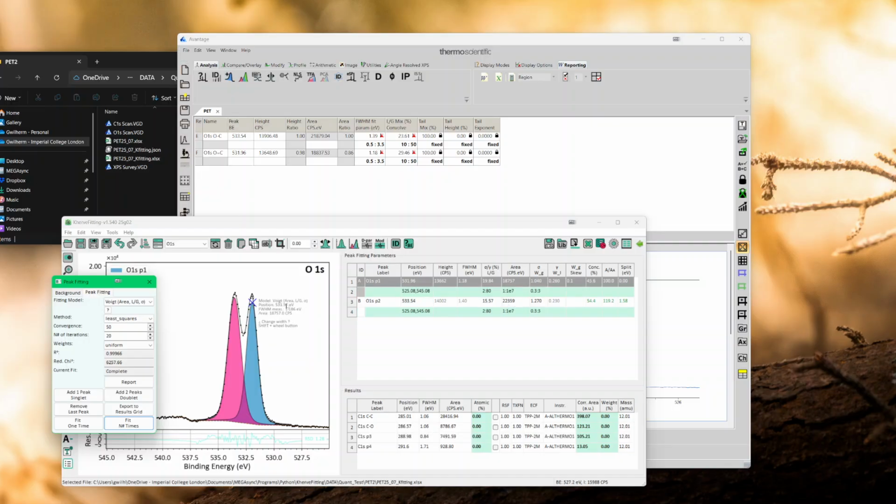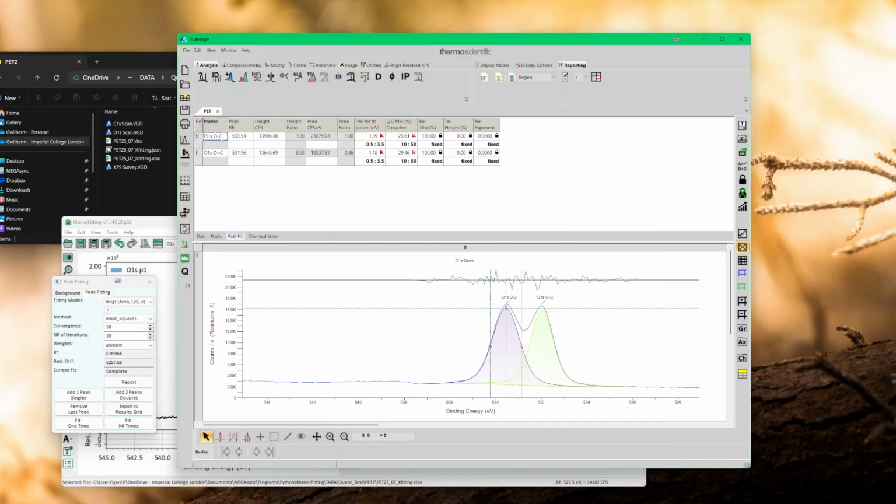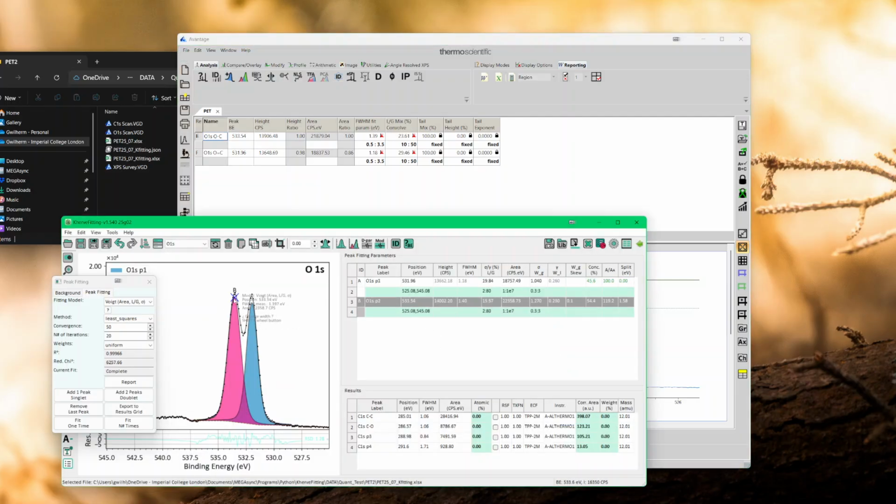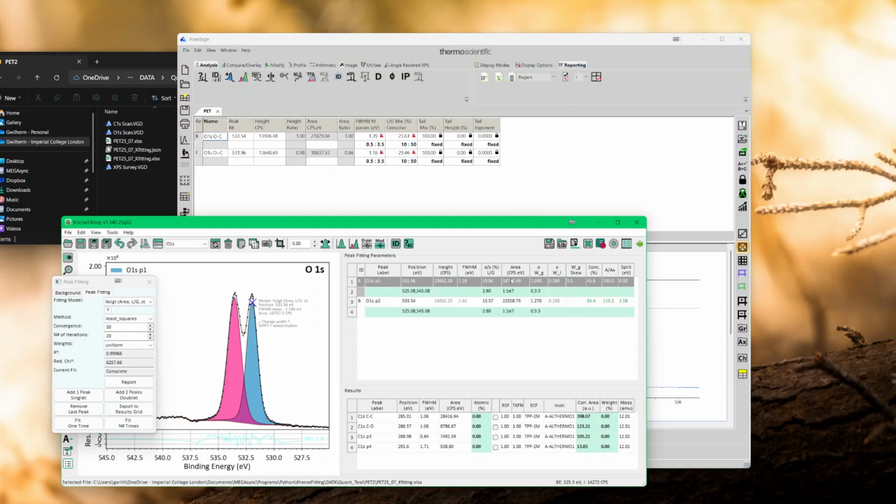And this one here is my peak, my second peak. So that's 21,879 for my second peak. And for my second peak, which is this one here, I get 22,358. So again, very close. And then 18,757 for the next one.